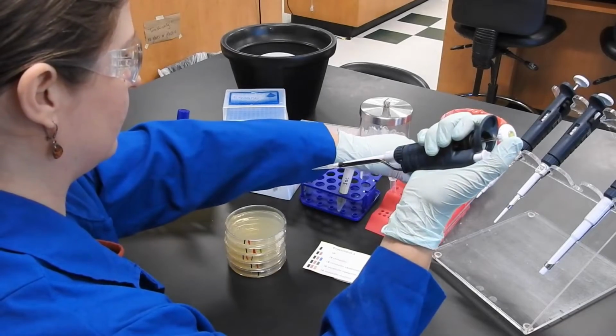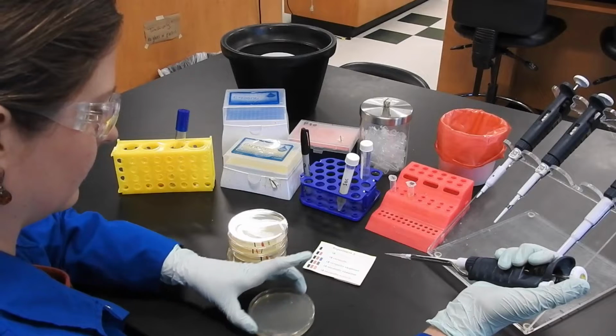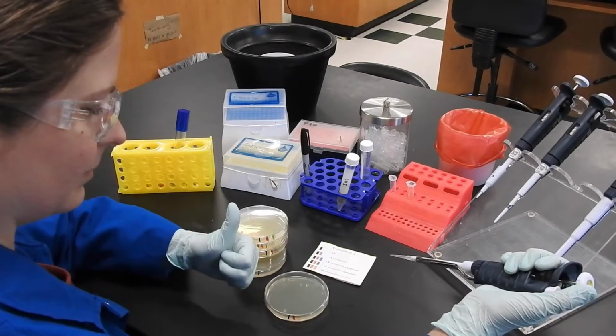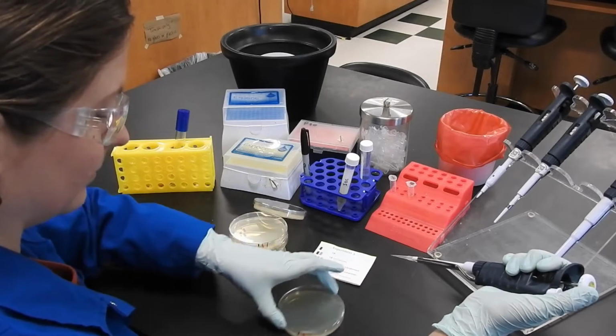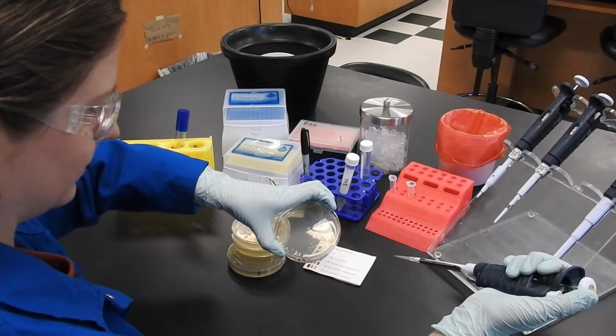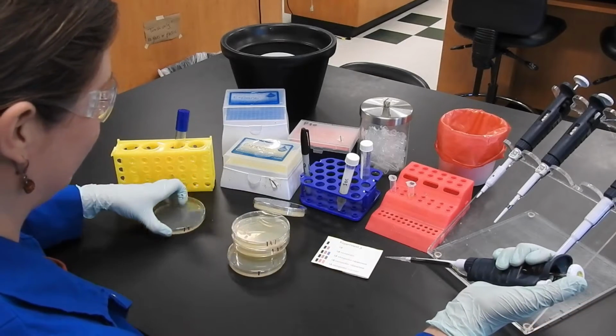To spread the cells, I will shake the plate back and forth so the beads make this sound. If the beads sound like this, you're doing it wrong and the cells are not being spread across the medium. Now I'll finish plating the cells and shake the remaining plates all at once.